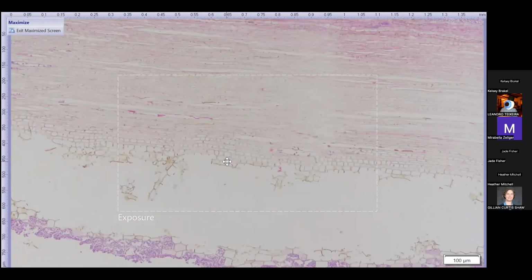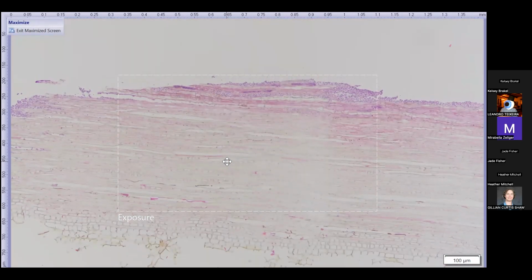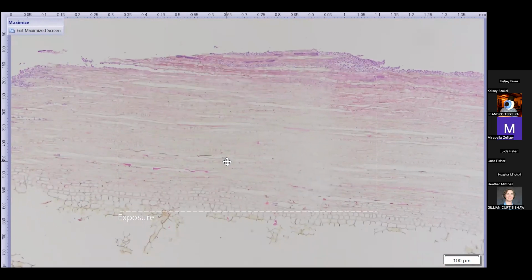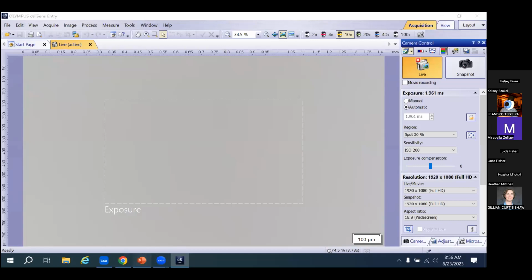So, yep, a contaminated foreign body entered the back of the eye, probably through the oral cavity, given the location, or migration from somewhere back there in this very young cat. So that was fun. And that was all I had. Oh, and the diagnosis. I guess I should finish and share the rest of it.